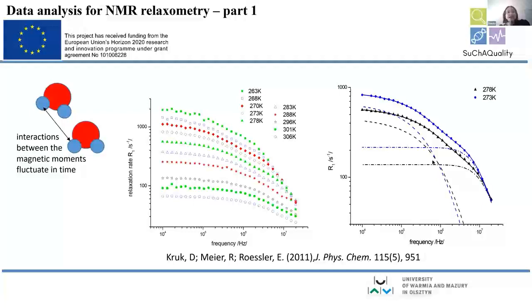And if you take a spherical molecule, according to the Stokes-Einstein equation, there's a relationship between a time scale characterizing translation dynamics and rotation dynamics. According to that, for perfect spherical molecules, the ratio between the characteristic time constants is 9. So let's say 10, order of magnitude. In practice, it's more like 50, 60 instead of 10. However, the translation dynamics is slower, let's say.